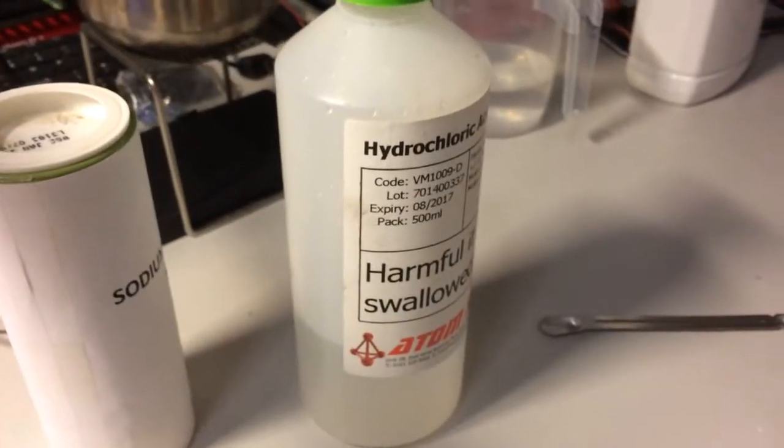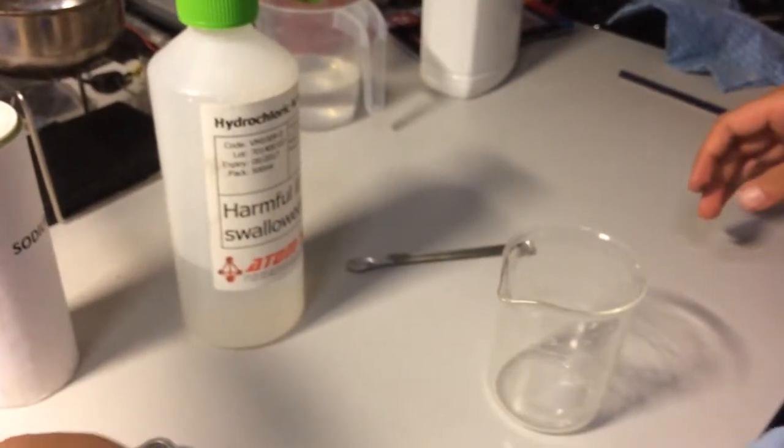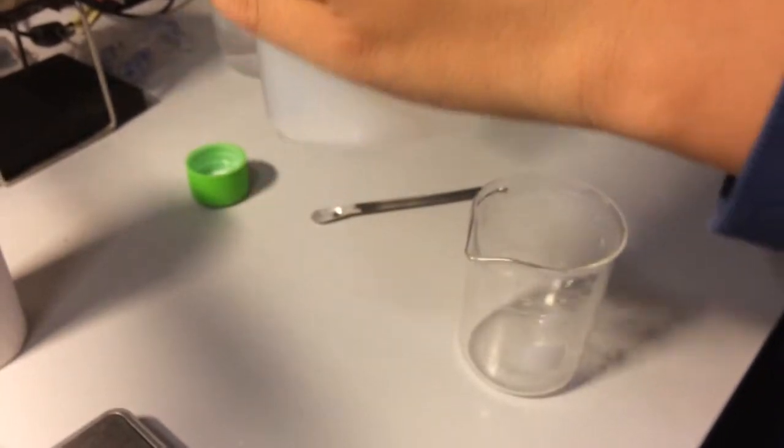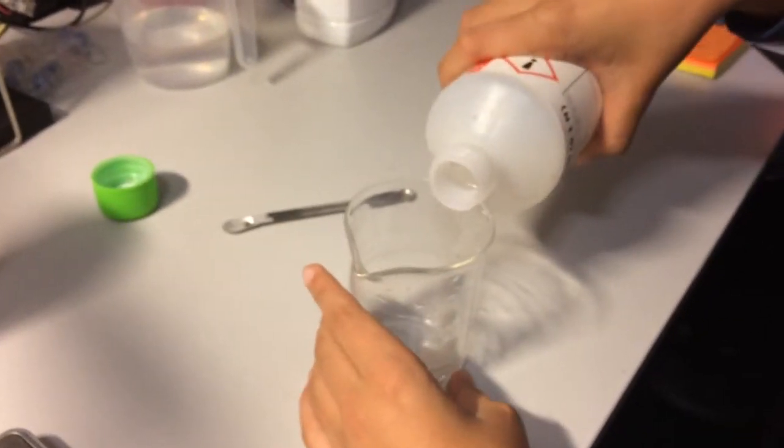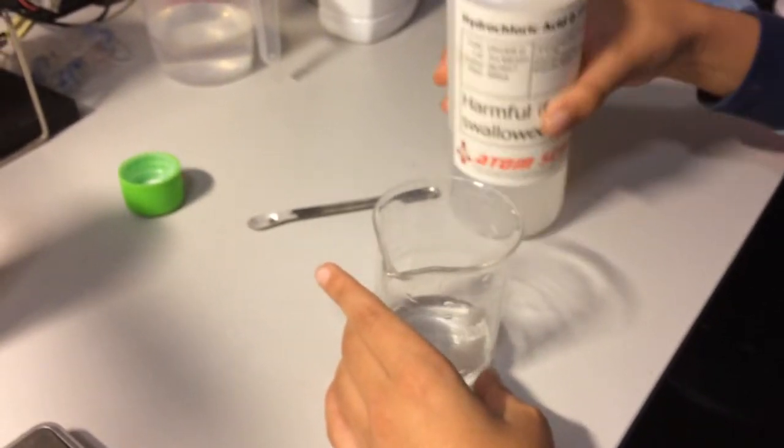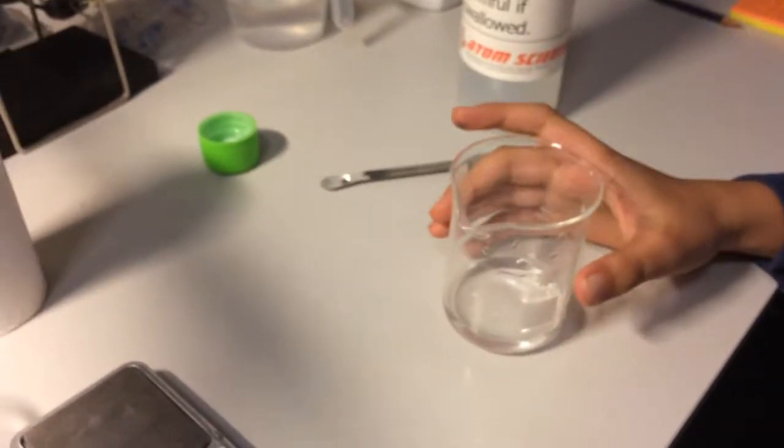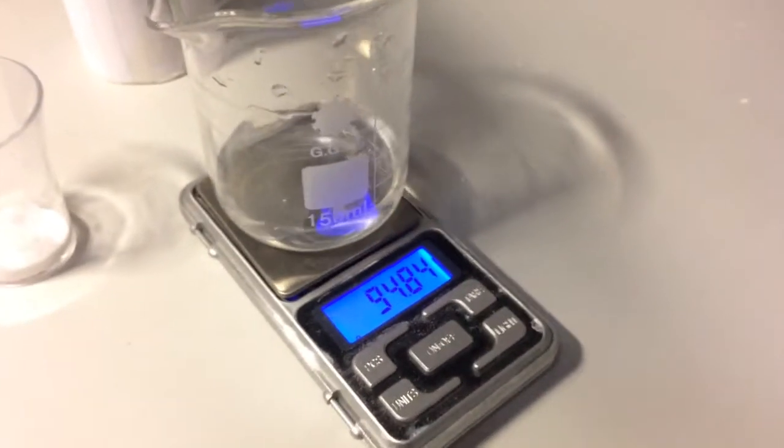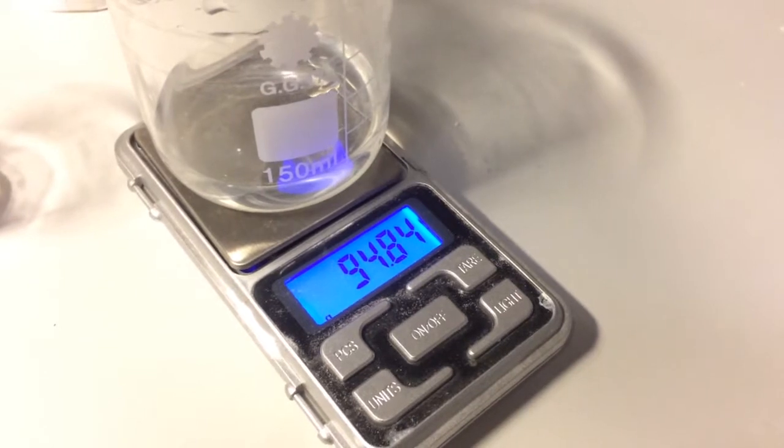Now we will measure 25 milliliters of hydrochloric acid and measure how heavy this is in grams. Here you can see it is 94.84 grams heavy.